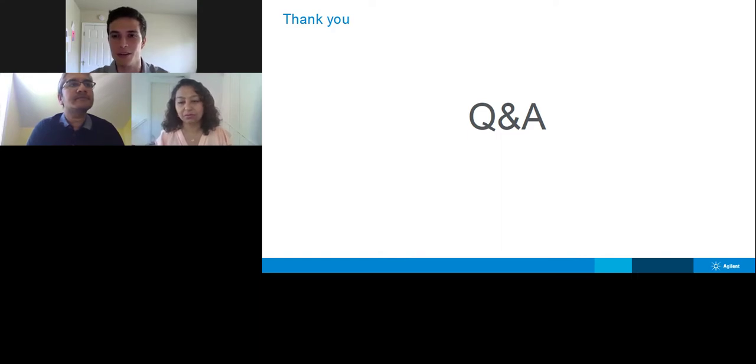And last question for you, Raul. For complex modifications like glycosylation, what is the extent of characterization that is needed, and how does one look at orthogonal tools? Yeah, so that's obviously a big question in the industry too.